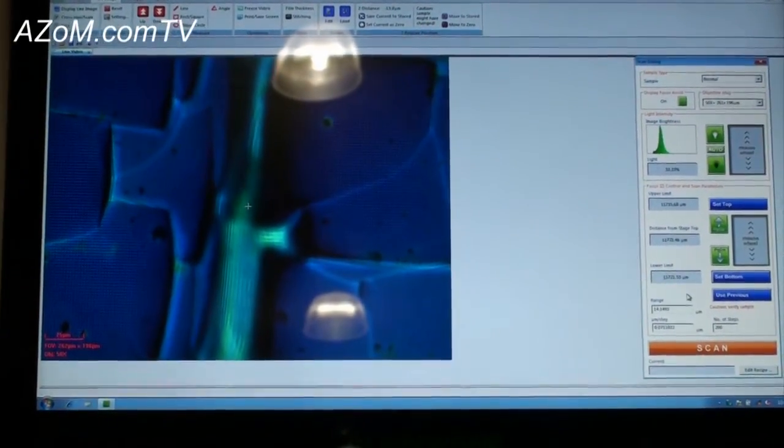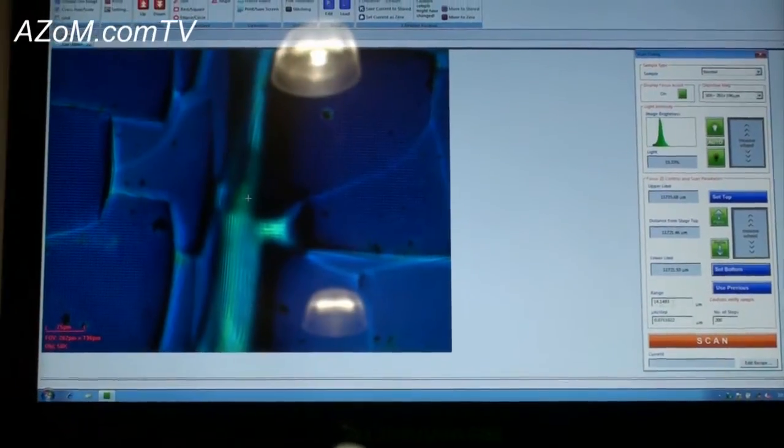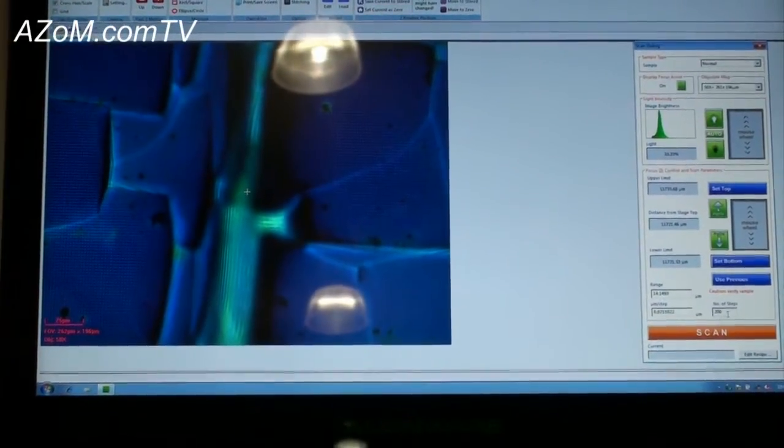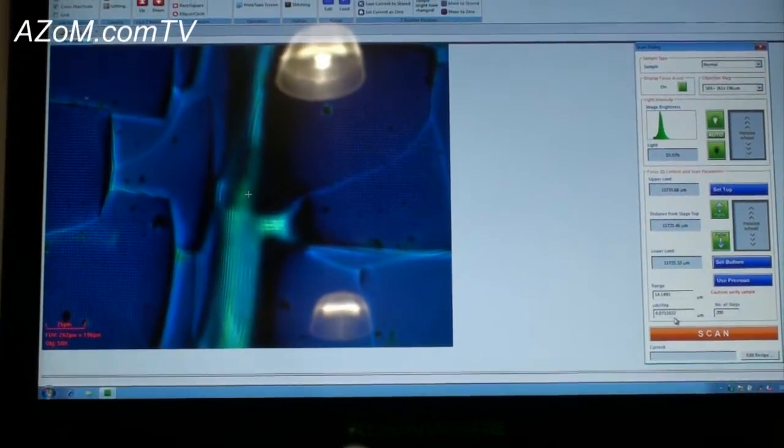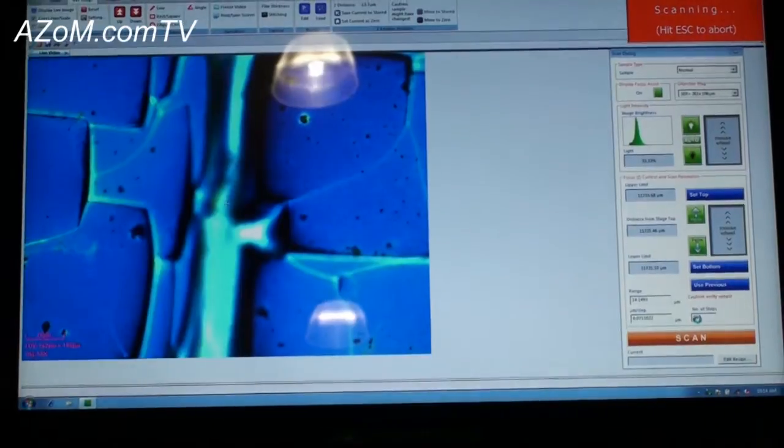Maybe increase this a bit. So we're going to scan a range of roughly 14 microns. And then based on our 200 slices that I currently have set, our resolution is going to be 70 nanometers per step. What I do is simply hit scan.